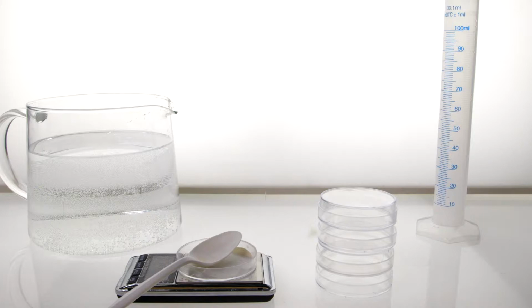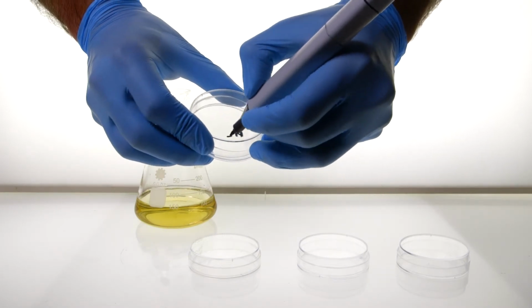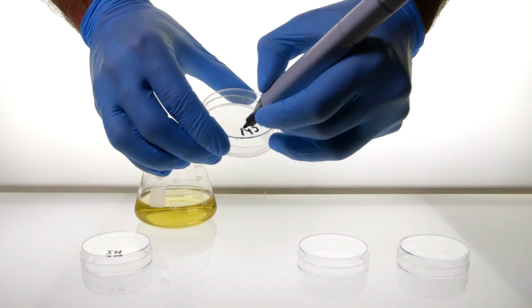You have to start and stop the microwave until all of the agar has dissolved, and you may have to stir or swirl it. Label the bottom of your plates, rather than the lid, as NS for non-selective, and CHL for chloramphenicol.